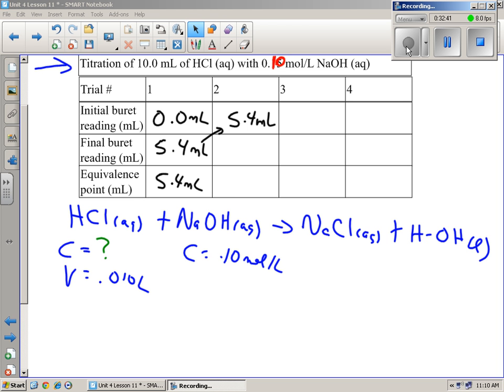Okay? So you're going to turn this on until you get like a little drop thing happening here. So very slowly, there's a drop. Drop, drop, okay? And you're going to stir it. Oh, by the way, another tip for you tomorrow. Put a piece of white paper underneath the aliquot. White paper allows you to see that color change a lot better, because the lab benches are black.